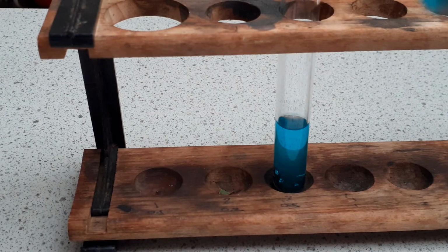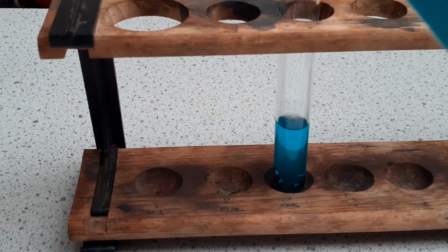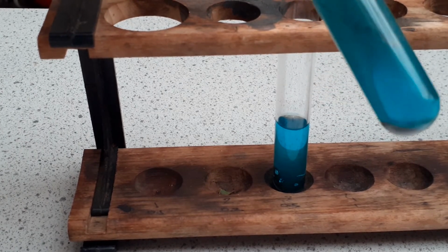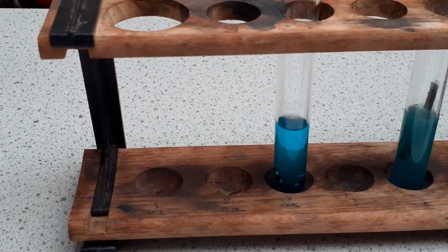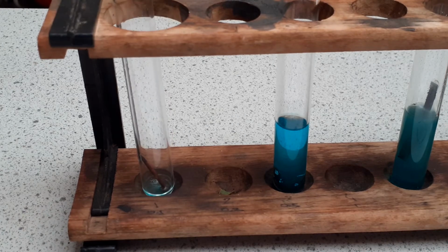And likewise, if we look at the magnesium, on the bottom of the test tube we've got a reddy brown deposit of copper. So a reaction has occurred there. Now in each of the cases here, as we can see, copper has been displaced by the metals that we are using. Let's move along to the iron.